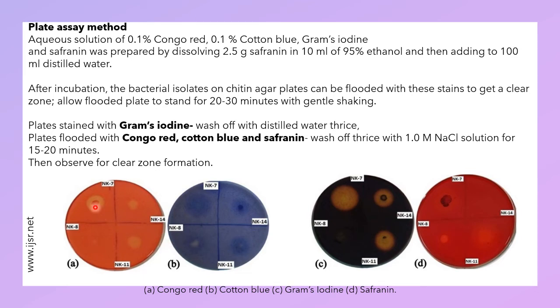Okay, so now you cannot use that particular bacterial colony for further testing. Correct? So be prepared with replica plates.